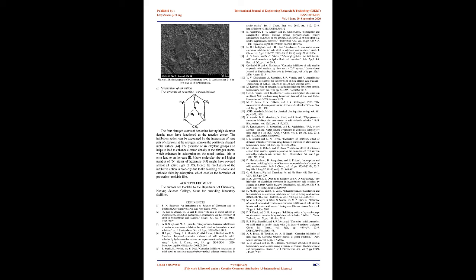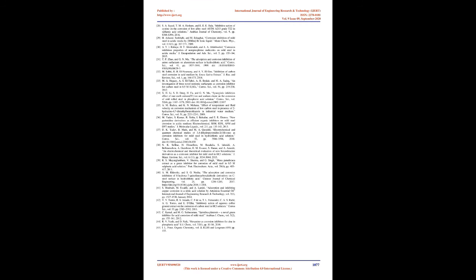Therefore, it is suggested that the inhibitors act by adsorption at the MS surface or solution interface, and the change in CDL values is caused by the displacement of water molecules by the adsorption of organic molecules on the metal surface, thus decreasing the extent of metal dissolution 42, 43.